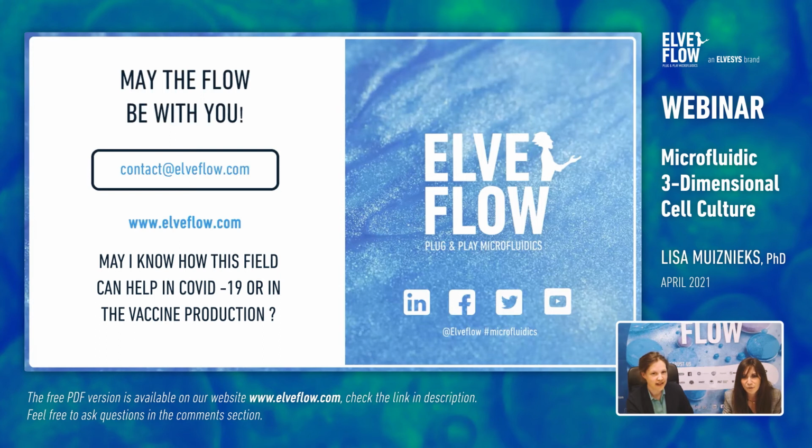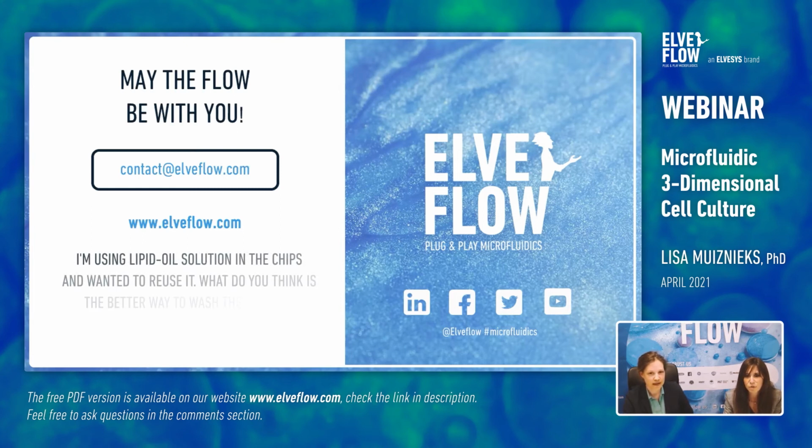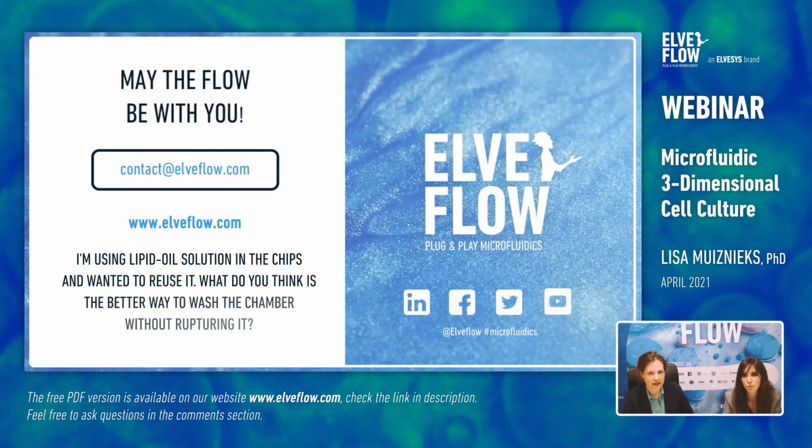I go back to the question of Marina Rana. Thanks for the amazing talk. I have a very specific question about my system. So I'm using lipid oil solution in the chips and wanted to reuse it. What do you think is the better way, to wash the chamber without rupturing it? To be honest with you, the standard cleaning procedure for chip are mainly using some disinfectant, water, washing with ethanol and air dry.